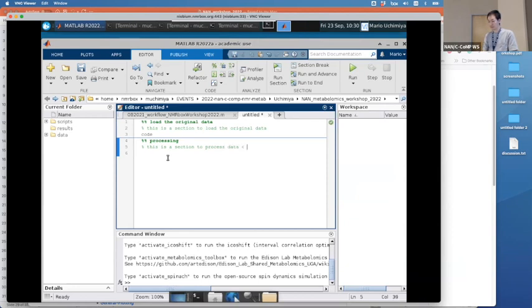One thing when you get into the workflow, we're going to be here, so you should raise your hand, say I'm stuck, I have an error, I don't know what I'm doing. But there are some sections that you can't skip. You can't just go from the top down to the bottom and say, I'm going to skip all this stuff and run PCA. It won't work, because each step you're renaming files. After Mario does an alignment, there's a renamed data file that indicates the alignment happened.